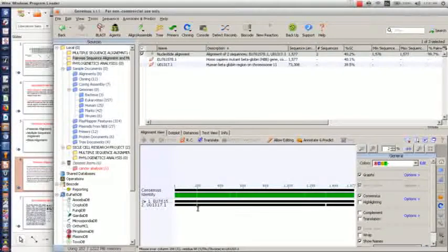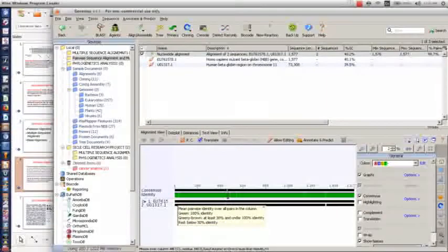But this is for you to understand that immediately you are given your result, you need to understand the nature of the alignment by looking at the consensus sequence. And this is the consensus sequence now. Look at the consensus sequence and look at the graph. Now this is the graph. So you see this area. This is for you to understand that there's an issue here.